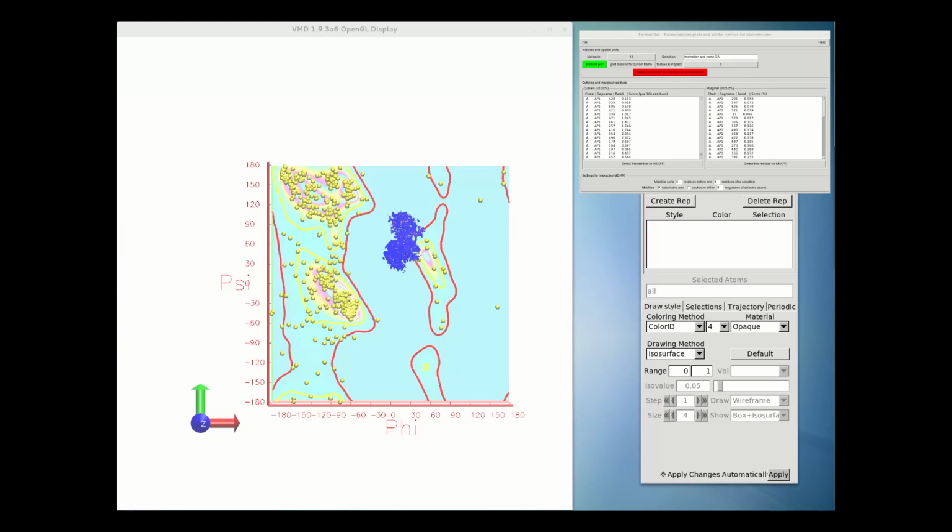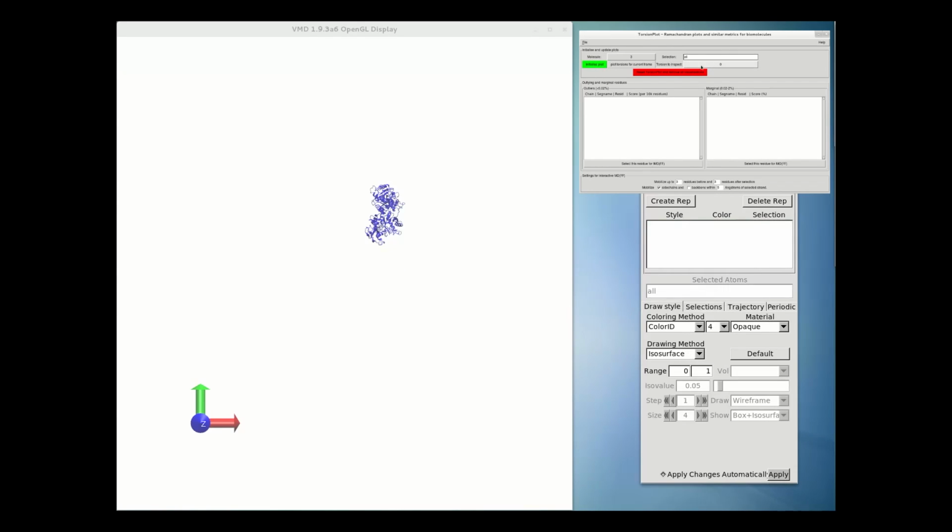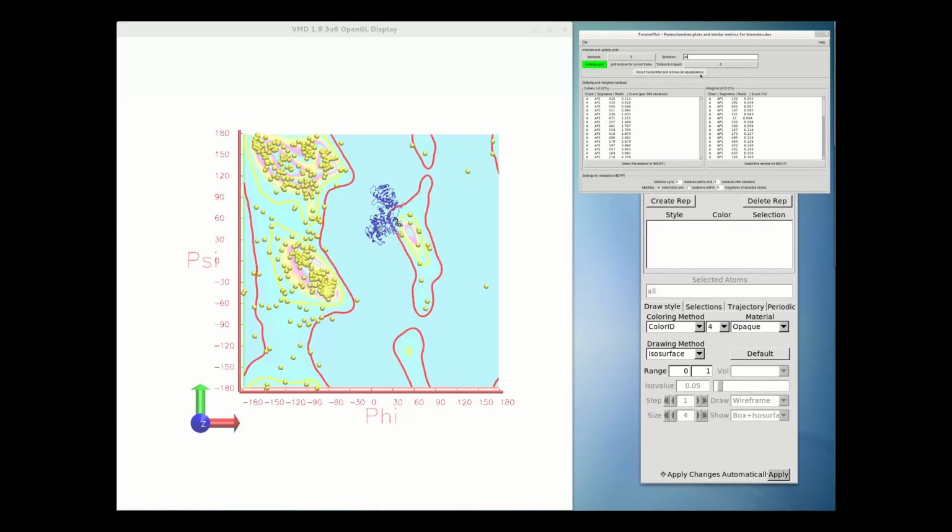Okay, now that's settled nicely, I'm going to stop the current simulation and commit the coordinates back to my master structure. And here's where the real fun begins. The sorted lists you see in the window at the top right are the current Ramachandran outliers, and they aren't there just for information. Selecting one of them allows me to quickly set up a much more targeted, interactive simulation to investigate and hopefully fix it.